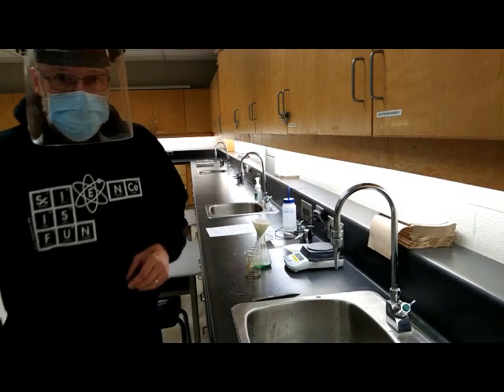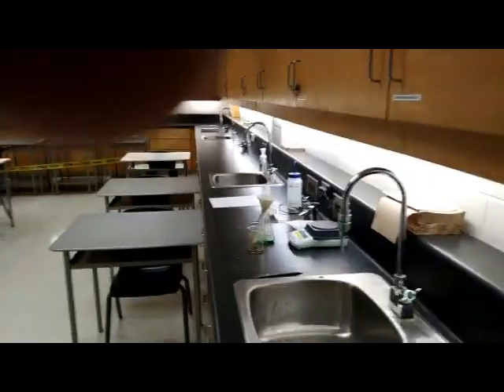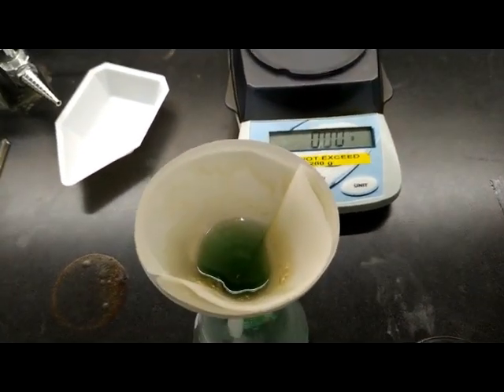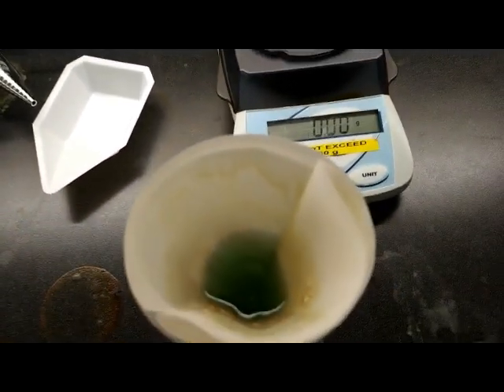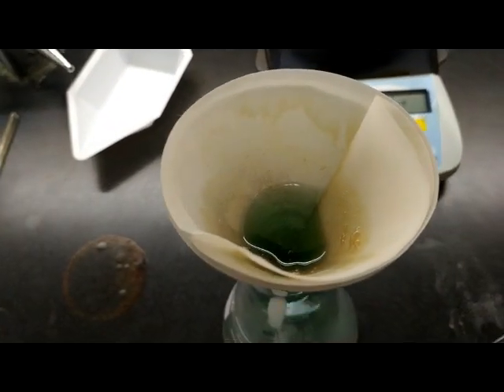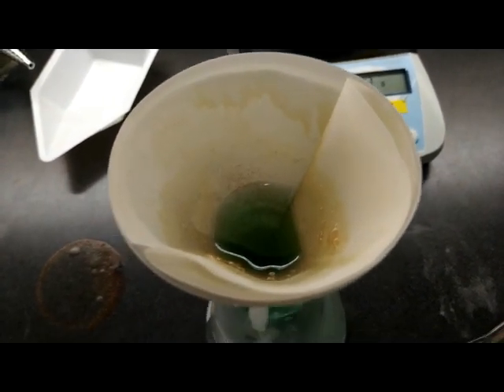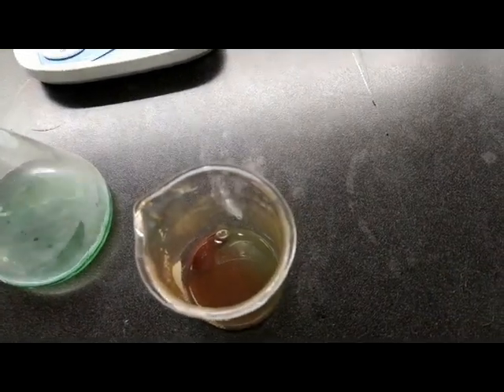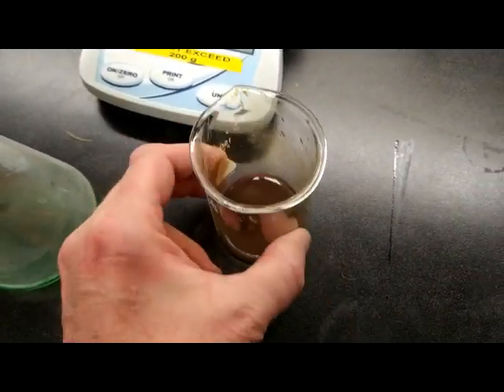The other thing that you'll notice, and I'll bring the camera a little bit closer here so that you can actually see. The other thing that you can see, if you're looking into the funnel, is some of the brown material on the inside of the funnel, and that's already some of the copper bits that were in the decanted solution. So we've already poured out a little bit of that material. And if all you were doing is decanting, you would find usually a fair loss of material. Okay, so there's a better view of the copper material.